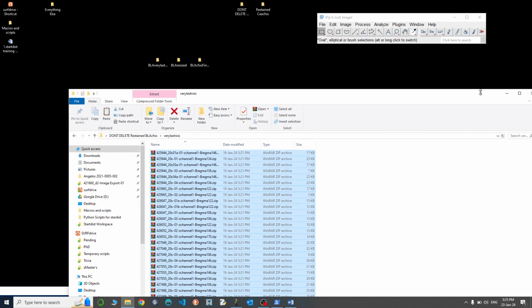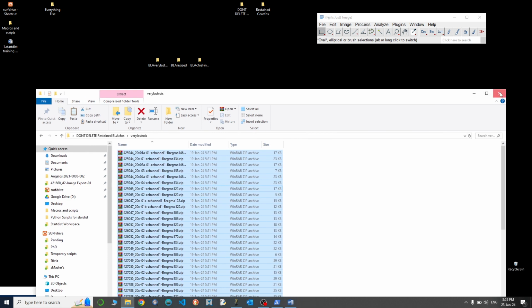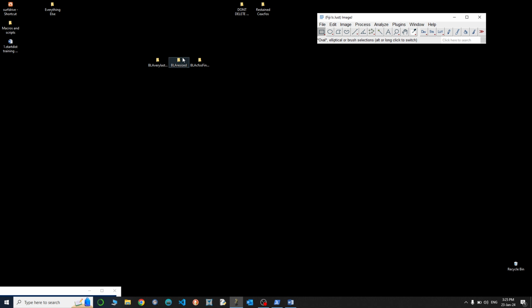Then I need the resized BLA photos. And when it comes to getting final data, I would recommend not using the white background images. At some point in the previous step, I actually mistakenly said that from now on we'll be only working with white background images, but the truth is that these white background images, if you recall, we created some sorts of masks to get the region that we were interested in and separate it from the background.